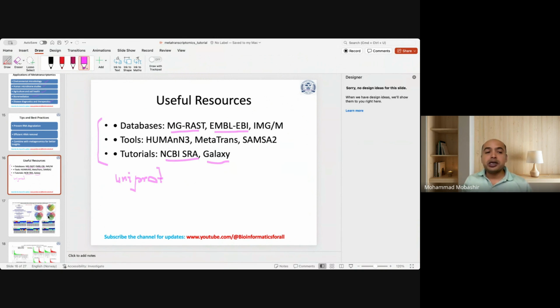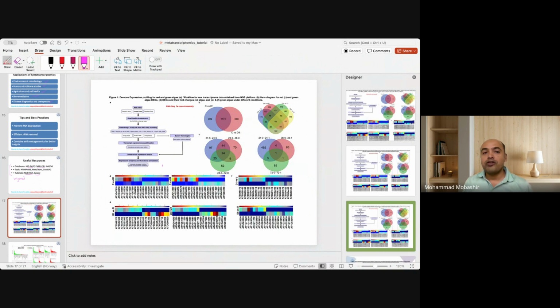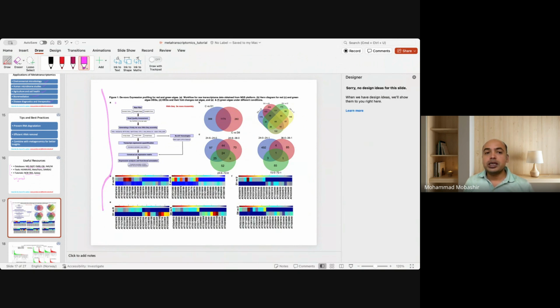And these are the real figures for the final analysis of metatranscriptomics data. For example, this is figure number 1, which is basically giving the details from pipeline to the gene expression level and comparative gene expression patterns in different types of samples. For example, C and D1, they are sample names. Then 24.6, 24.0, these are the sample namings.